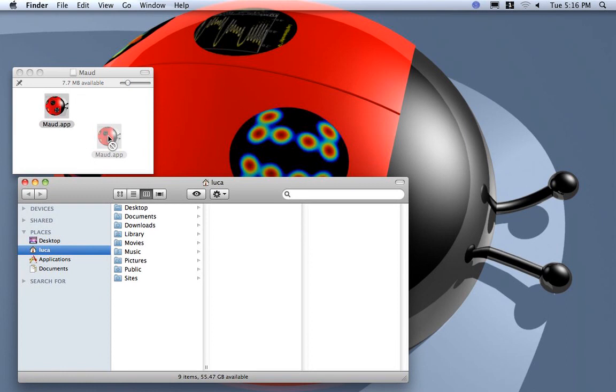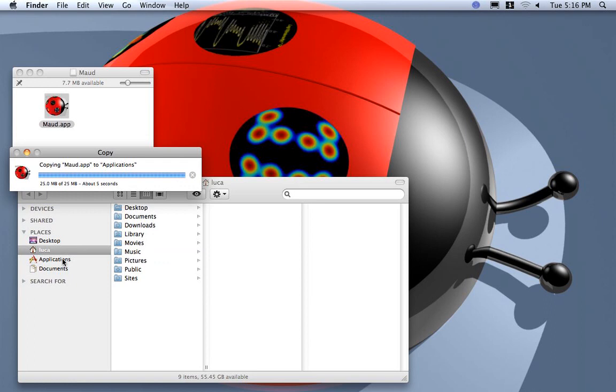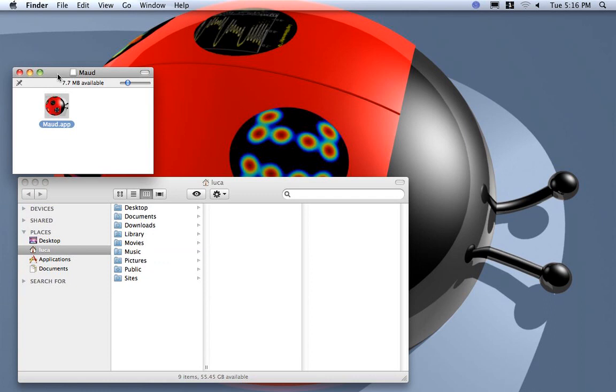For Mac everything is in this app so I just put it in the applications folder so all users in this computer can use it. For installation this is everything you need.